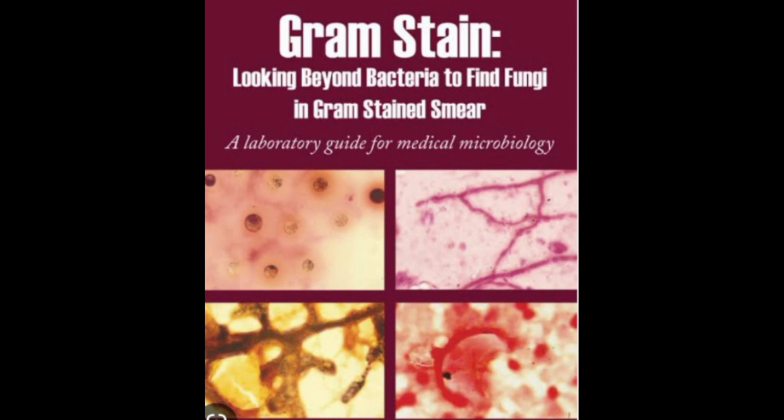Procedure: make a smear of the specimen on a clean labeled microslide and allow to dry. Heat fix the smear to the slide by passing the slide 3 to 4 times through the flame of a Bunsen burner so that the smear does not wash off during the staining procedure. Gram staining: 1. Stain the slide by the gram staining procedure. 2. Cover the smear with crystal violet and leave it for 1 minute. 3. Wash the slide with water.